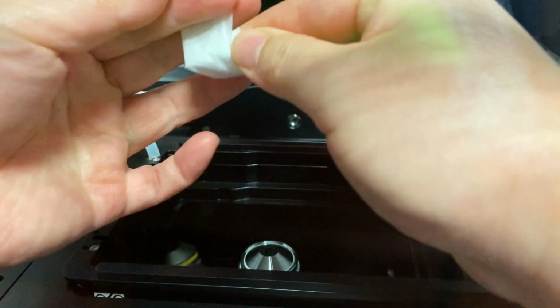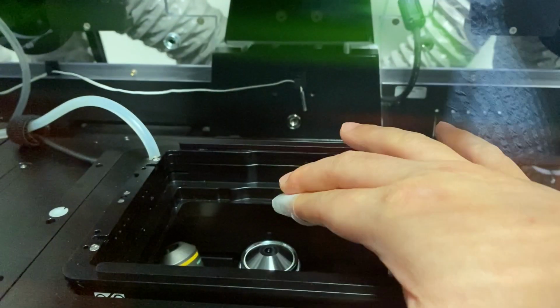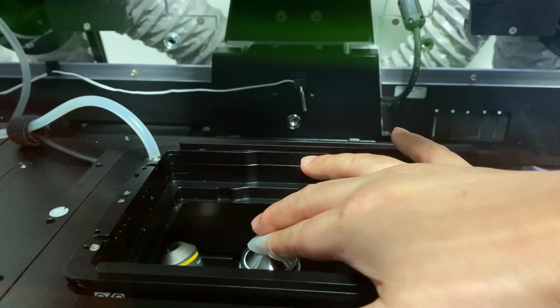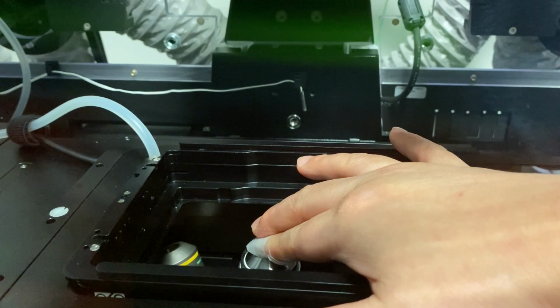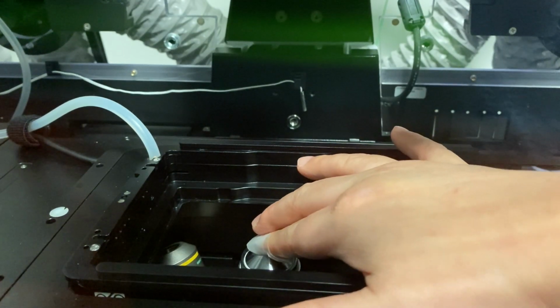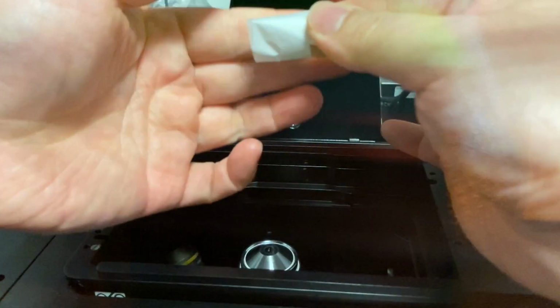Using a new lens tissue with some ethanol, you want to clean the surface of the lens. You want to be firm but very gentle. You don't need to apply so much pressure that the lens starts to dip down. So you want to just clean the lens like so. And again, with new lens tissue and ethanol, you want to do this 3 times.